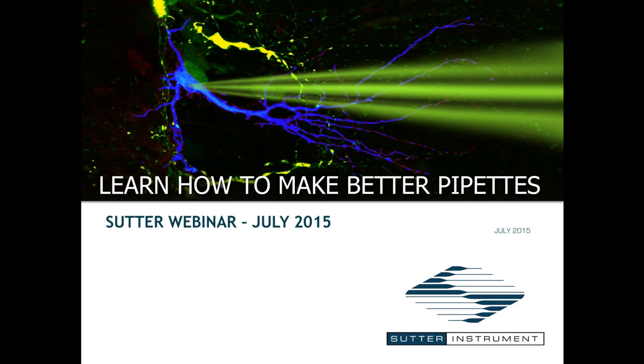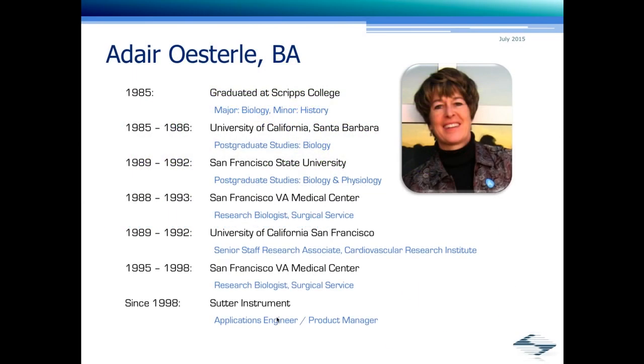Well, usually when you're pulling your pipettes and you're designing your program, the jaws get warm, and they warm up to around 45, 55, 65 degrees Celsius. And when you design your program and you find that midpoint velocity, you've pulled maybe 10, 20 pipettes. Once you start using your pipettes, the jaws are pretty hot, and so that residual heat in the jaws is sometimes a key factor to making sure your pipettes are turning out okay.